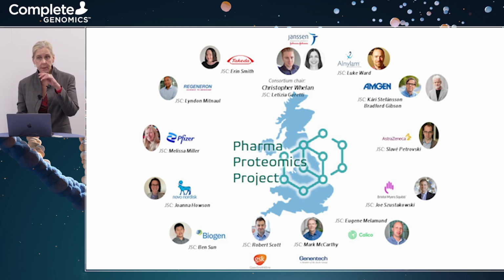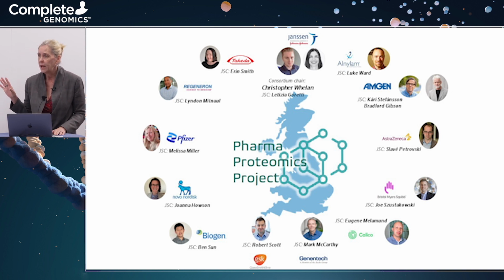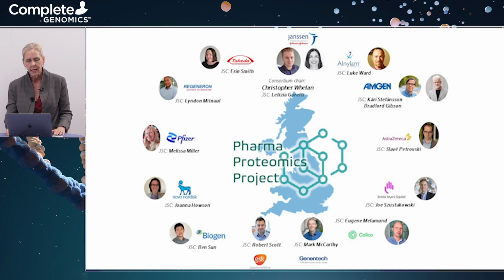These are mostly baseline samples from the UK Biobank. This is the largest proteogenomics project that has ever been done, and it's called the UK Biobank Pharma Proteomics Project. Now they're just scratching the surface of what they're able to do with these data, and they're publicly available on the DNA Nexus Research Analysis platform.